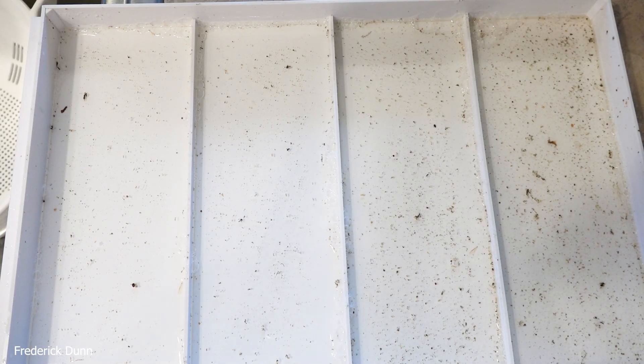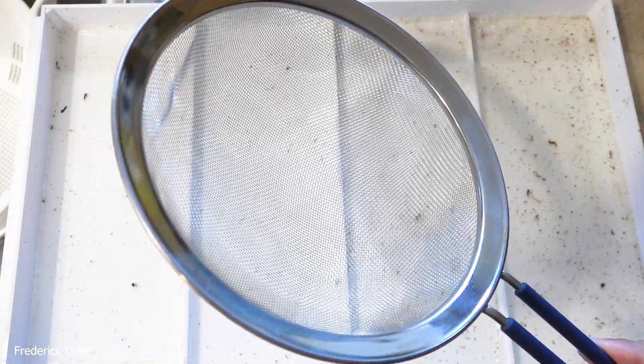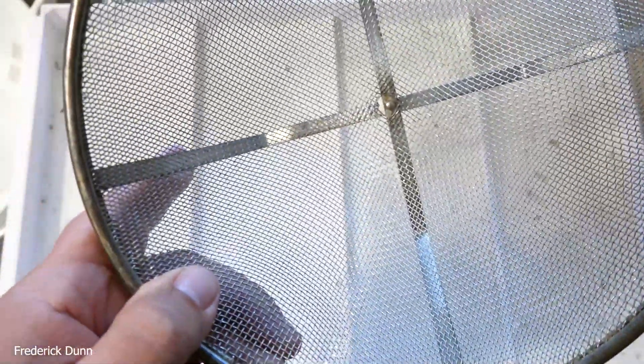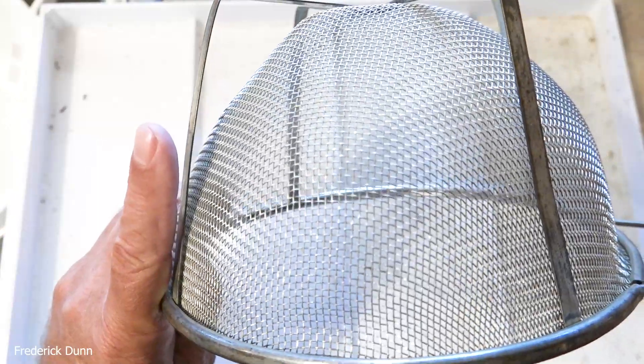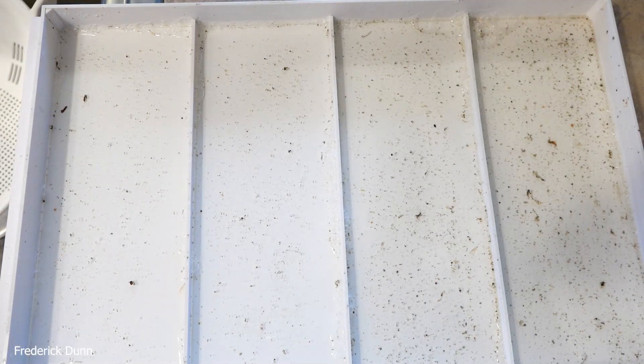Yesterday we did a demonstration video showing counting mites in dead out honeybees from packages. Today we're going to revisit that so I can demonstrate the procedure and prove that the method I use to count the mites will actually work with mites present, because the issue yesterday was no mites showed up in the dead bee wash and count. So now we want to make sure and test the method.